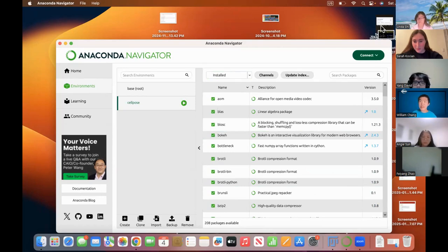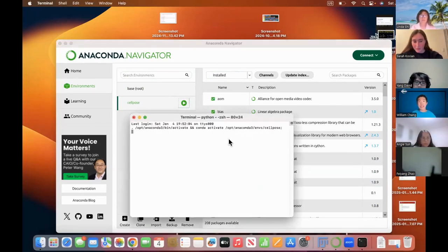That was a good amount of information. Does anyone have questions? Feel free to raise your hand and ask straight away, or put your question into the chat. I'll go ahead and start the initialization with Cellpose, and then if you guys have questions, please ask.